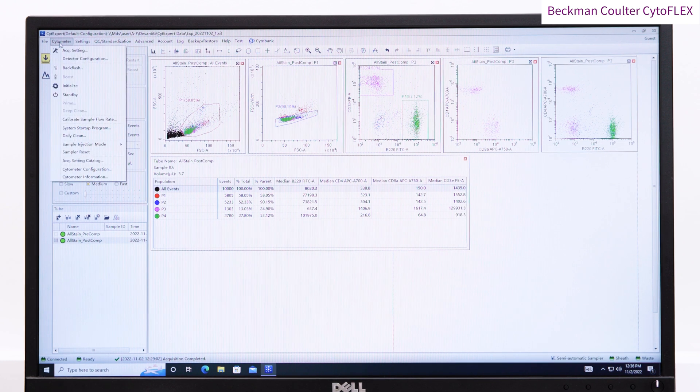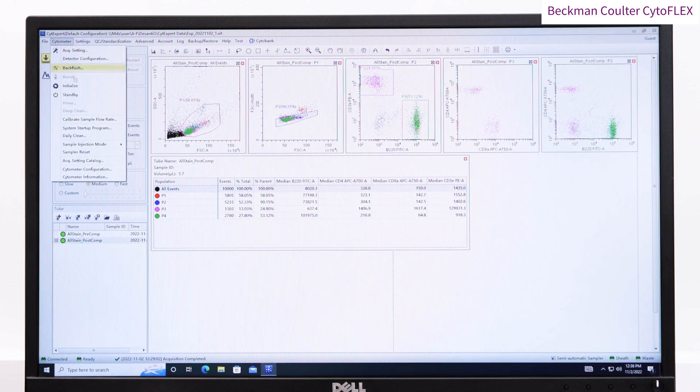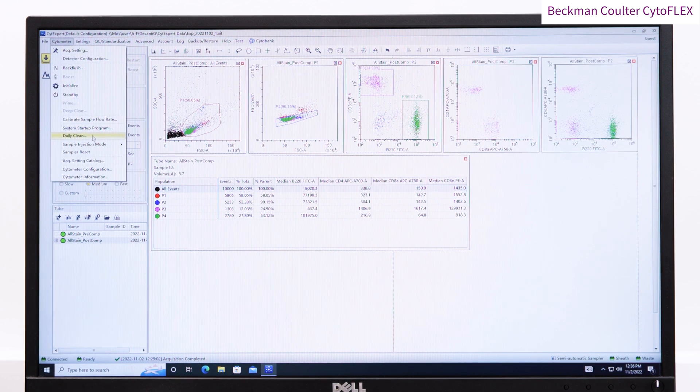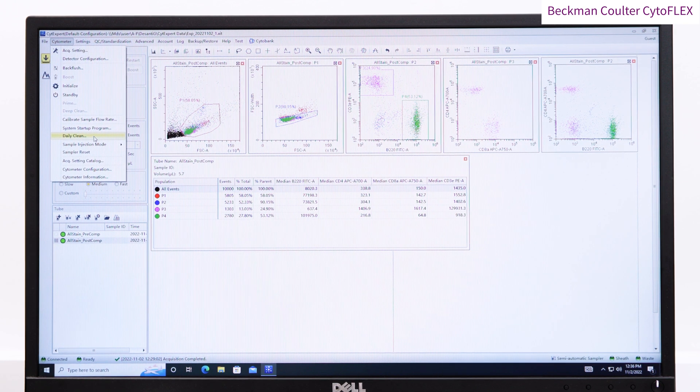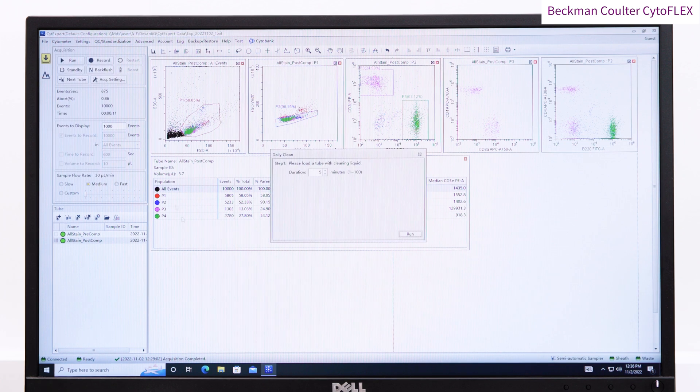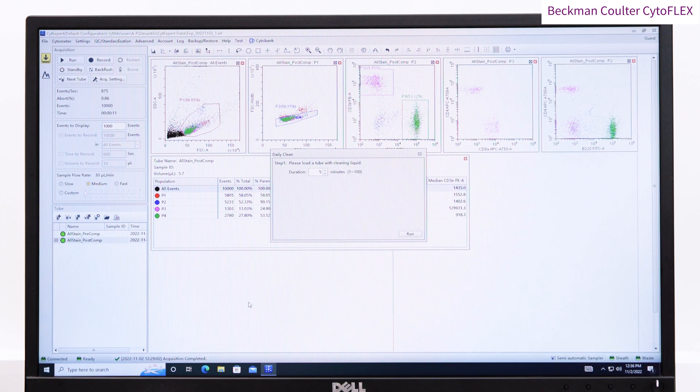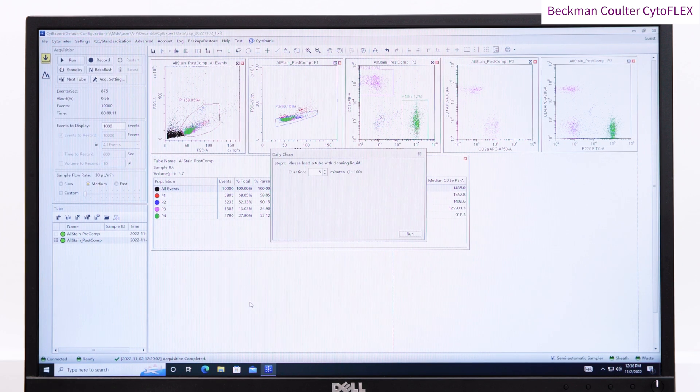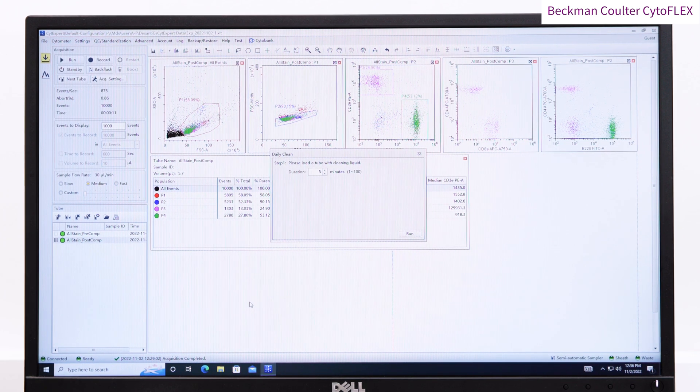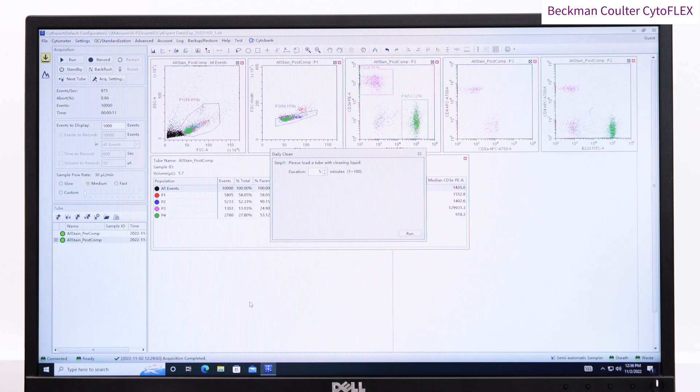Once finished, clean the machine by running the daily clean and following the on-screen prompts to run a tube of cleaning fluid, such as flow clean or bleach, and then a tube of deionized water.